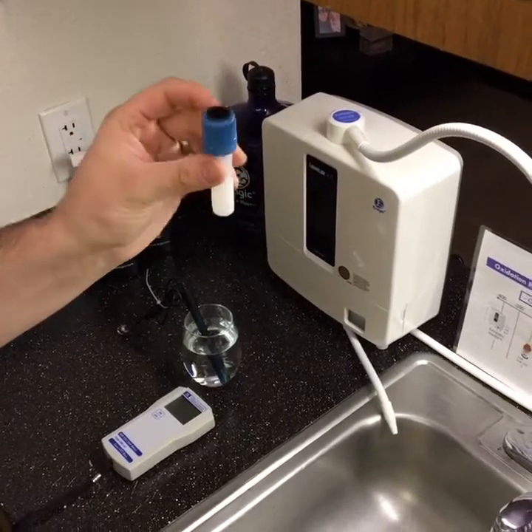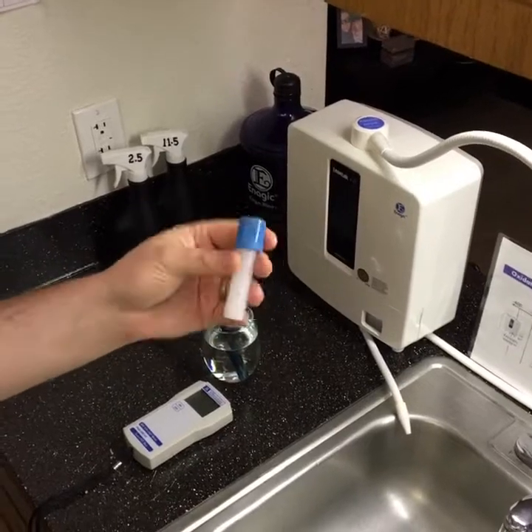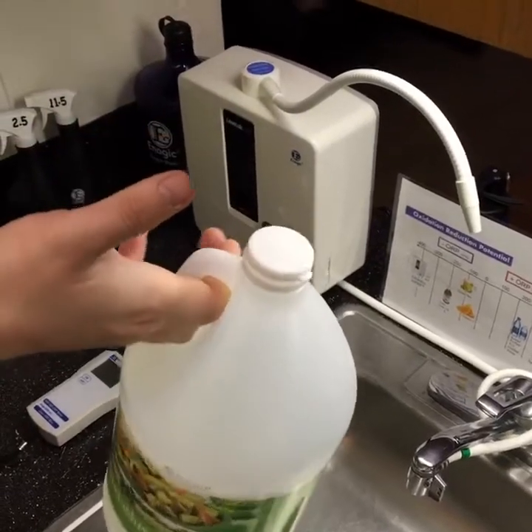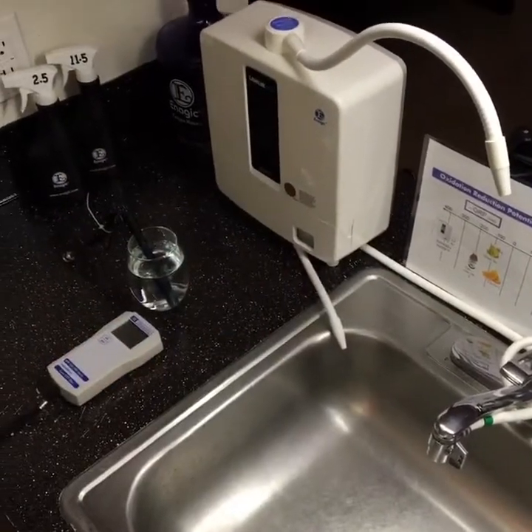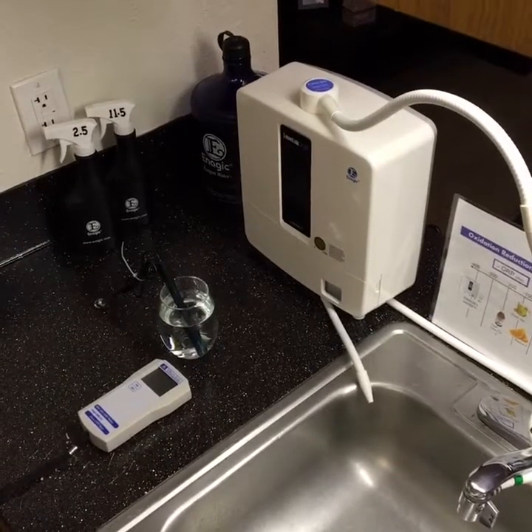Just make sure the vinegar doesn't get cloudy. If it gets cloudy, change the vinegar. Vinegar is cheap — you pay 98 cents and get a giant bottle. Vinegar is vinegar. There are no special solutions or fluids you need. It's very simple.